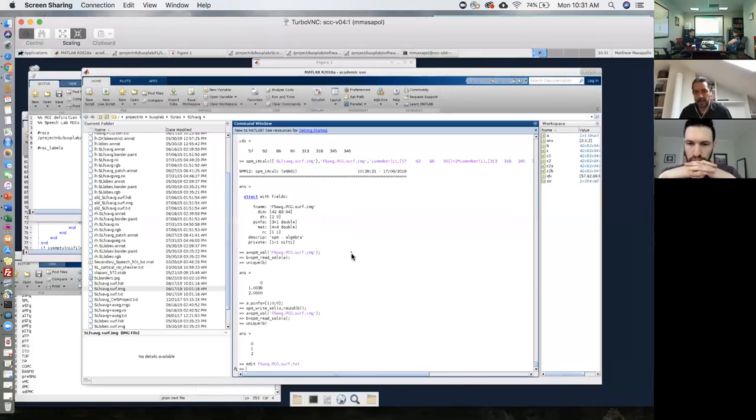And you have this new ROI file that you can enter into pretty much all software packages, and it will be interpreted as a correct ROI file that combines this. Well, it has two sub-ROIs, sub-regions in it. Right, the whole original walkthrough was a little longer than necessary as we ran into many issues. But yeah, this is kind of the summary of it.